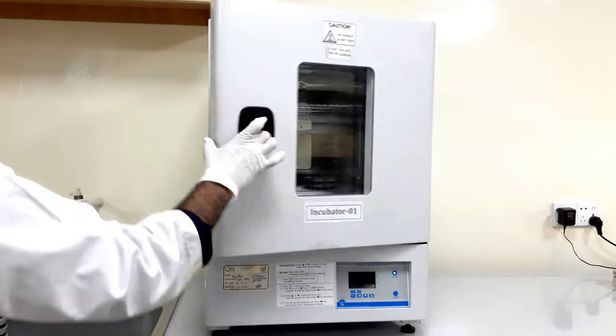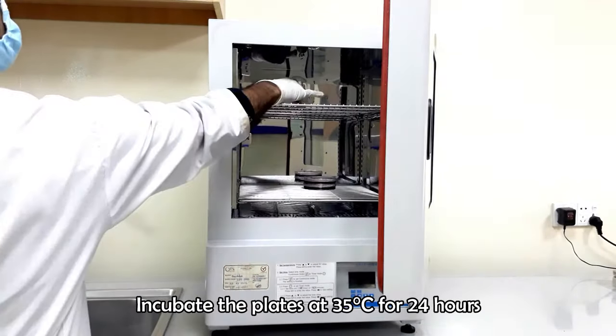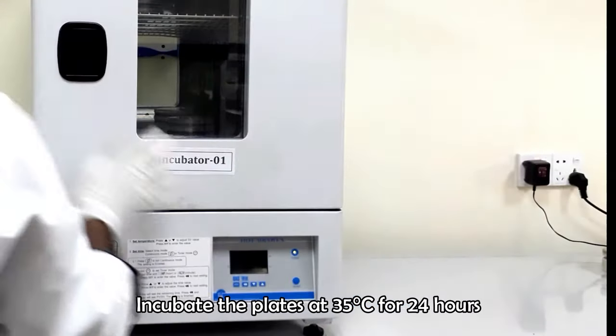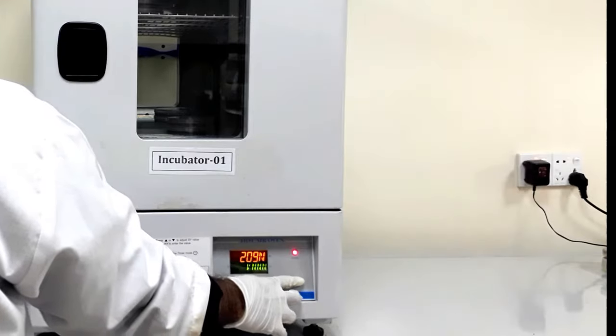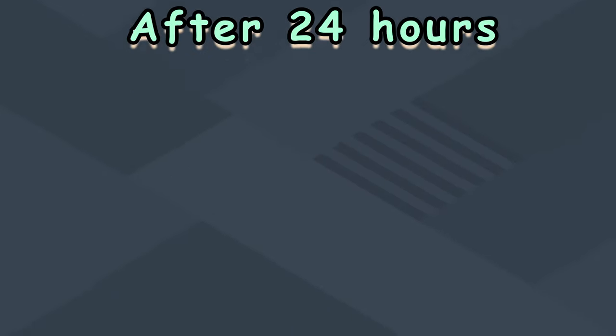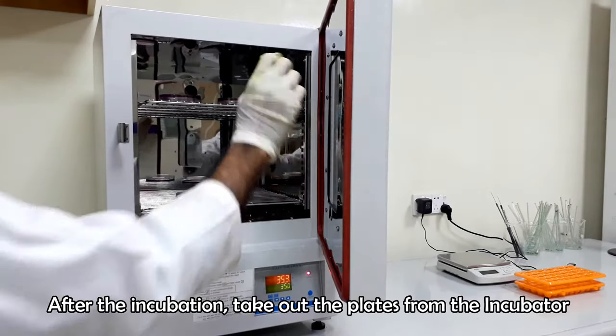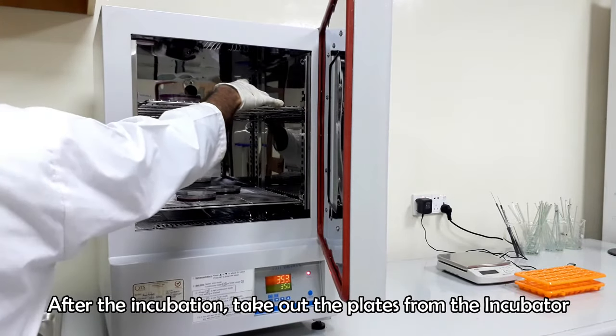After solidifying, invert the inoculated plates and incubate them at 35 degrees Celsius for 24 hours. After incubation, observe the plates under a colony counter.